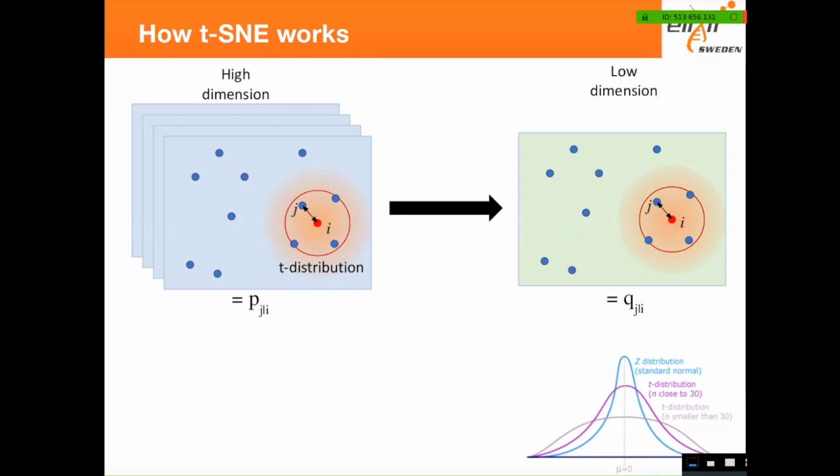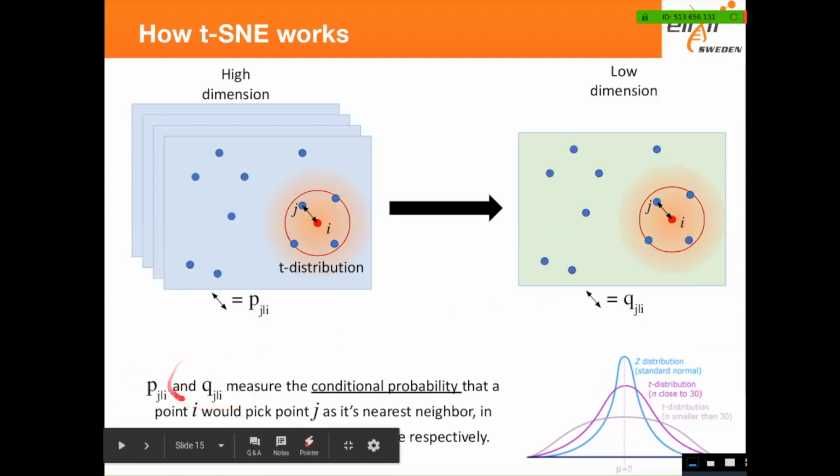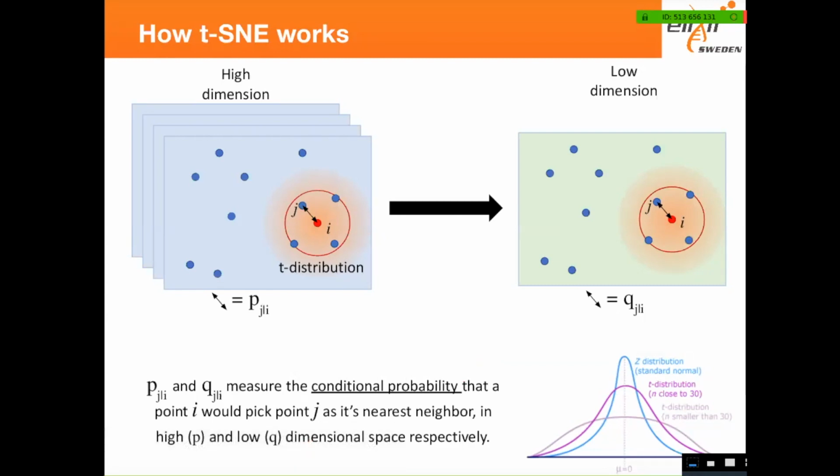Yeah, so this is just in general terms. The probability of those two in the multidimensional or the low dimensional space should be very similar to each other. Correct. So the idea is that when you optimize the graph, this graph should really represent your original data in terms of data structure, let's say.